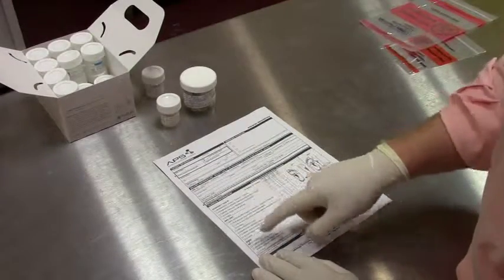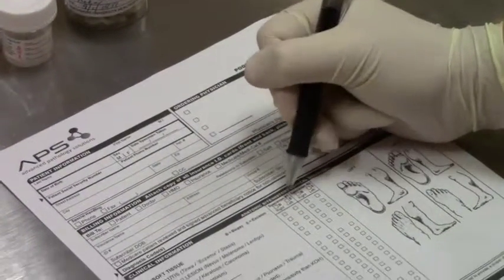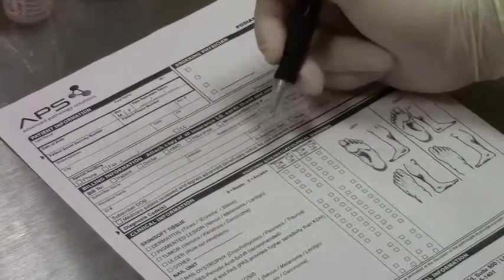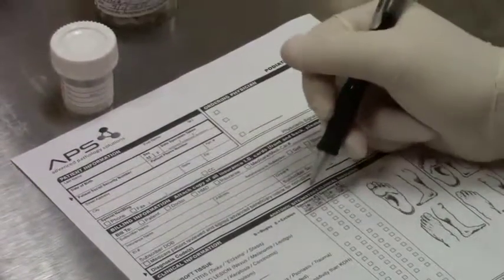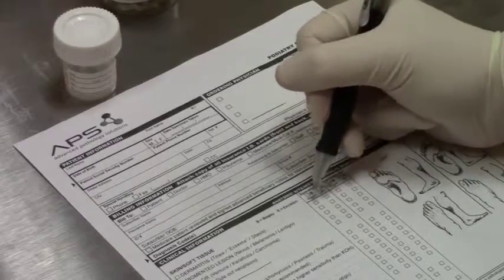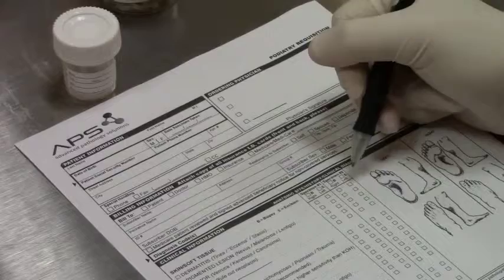Once you label out what kind of specimen it is, and then also too, if you have a specimen 1 and a specimen 2, you can just label 1 and 2 on the top of the lids or on the side of the bottle. And then if you would check for us what side it's from, if it's for the right foot or the left foot, on that specimen 1 or specimen 2, the same thing.